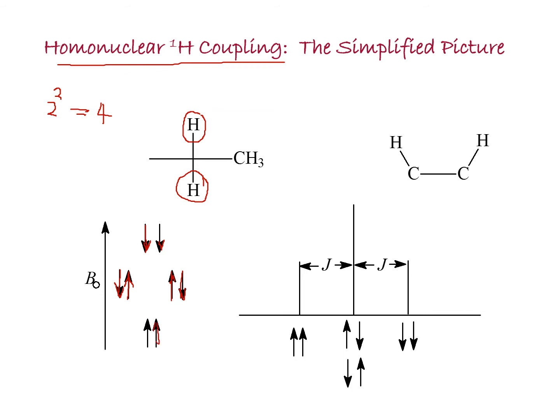and both going up. Here will be minus 1 magnetization. Here is 0, and here is 1. This will raise up the B net a little bit higher and will show up at higher frequency.